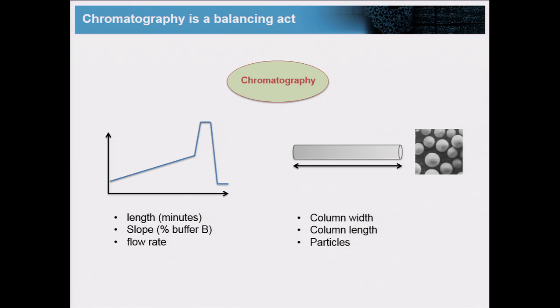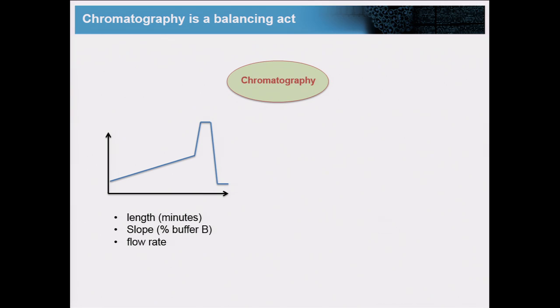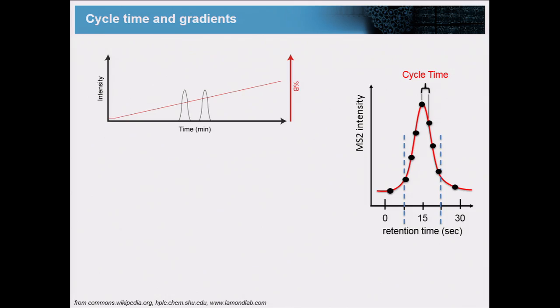What kind of particles are we going to pack? Etc. And these different aspects of the chromatography are related to cycle time, acquisition time, and the number of transitions.